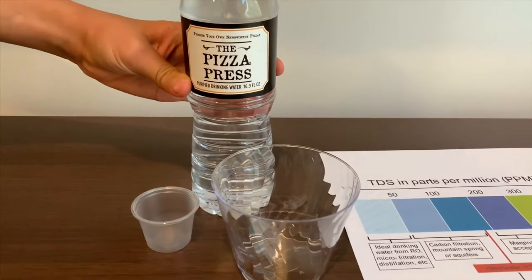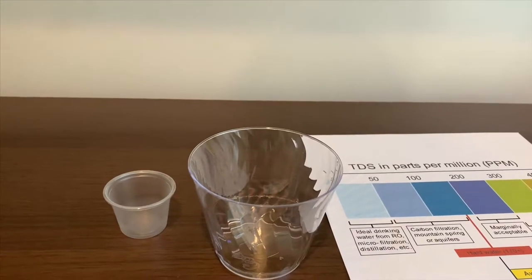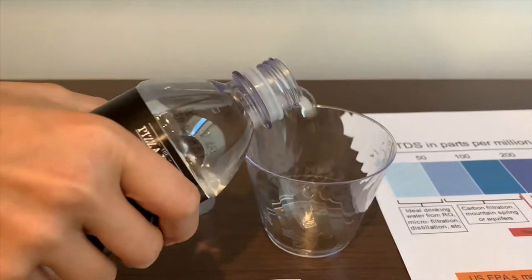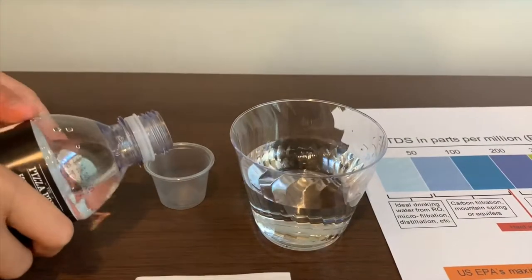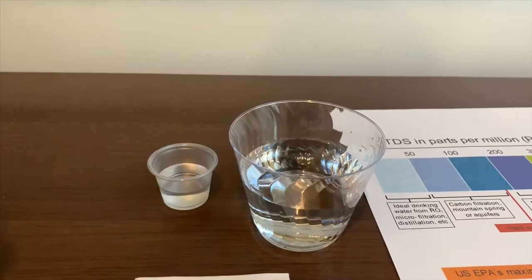This is purified drinking water from the pizza press. It costs $1.00. Let's put some water in. Let's try not to pour too much inside the pH cup. That's enough.